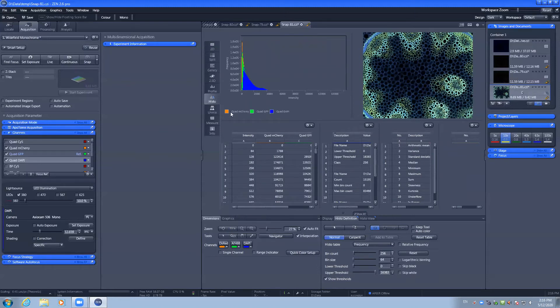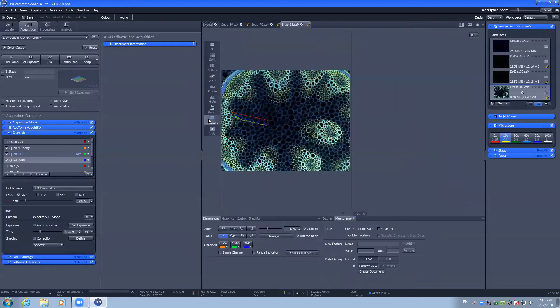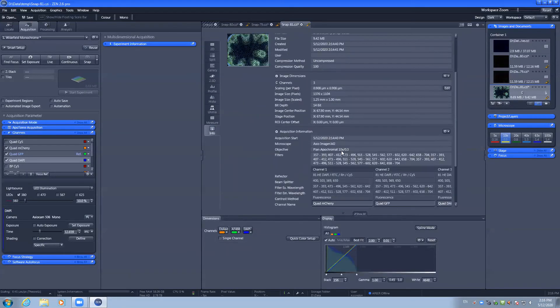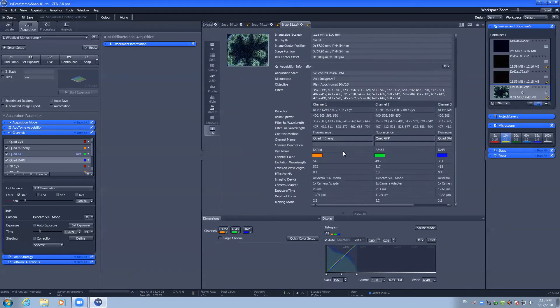The measurement tab allows you to perform measurements on your image and the info tab shows you the metadata for your image capture including the filters that were used and the settings such as exposure times.